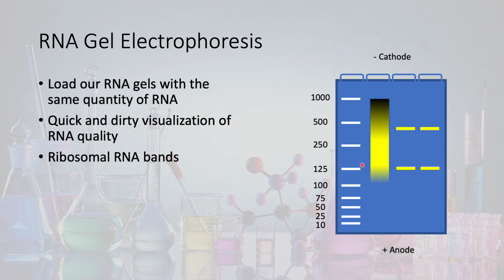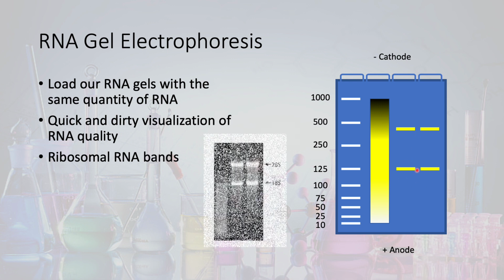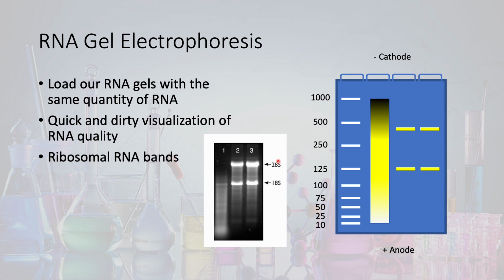And once we turn the power on, what we're hoping to see is over here, right? In lanes 3 and 4, we want to see two separated out bands. And this will be, if you've read the protocol, this will represent the ribosomal 28S and 18S ribosomal RNA bands. In a sample that's degraded, we will see this smearing of RNA, right? This is undesirable, and we don't want to see this.